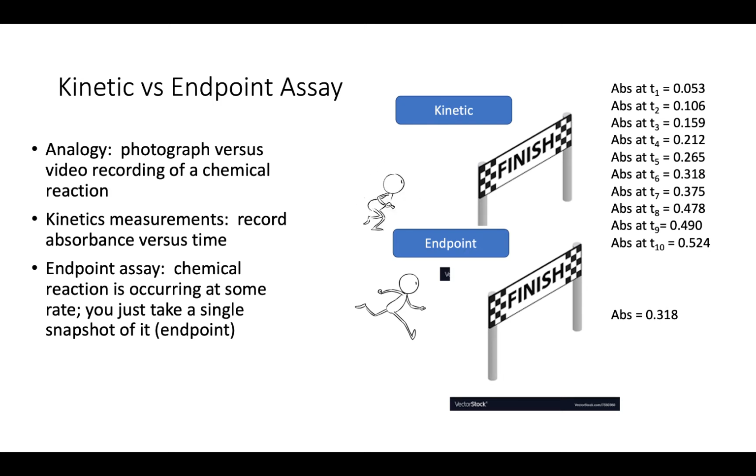The second assay, the BCA, is an endpoint assay. What do we mean by that? It means we still have a reaction going on, but we're going to measure the reaction at one time point. So the reaction could be occurring before it, it'll occur after it, but we're measuring it at a single time point. So, with that said, you will have a lot of different measurements to take. Speed of taking your final endpoint measurement is critical for the BCA.